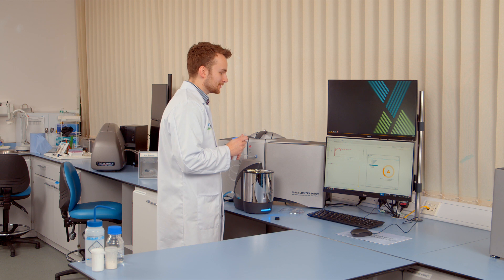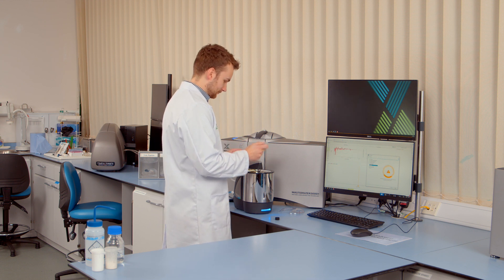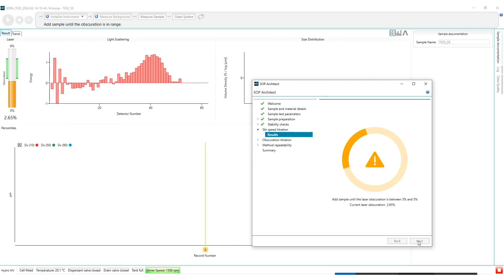So I'm now going to add the sample again until we reach the desired obscuration value. So now that we've added the sample it's going to stabilize at each stir speed for 30 seconds before carrying out a series of measurements at each individual stir speed. This will take between 15 to 20 minutes and allows you to go have a bit of time for a cup of tea or respond to some emails.